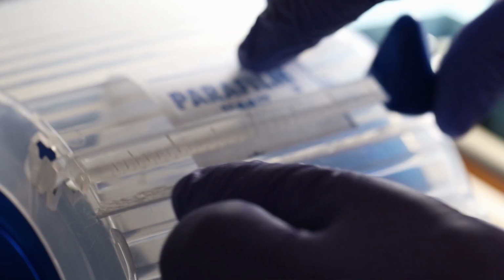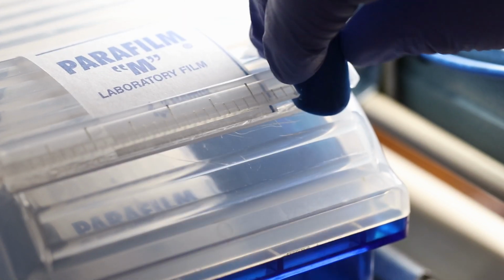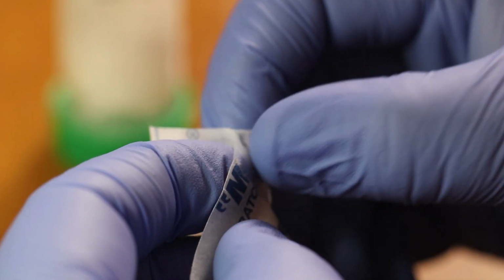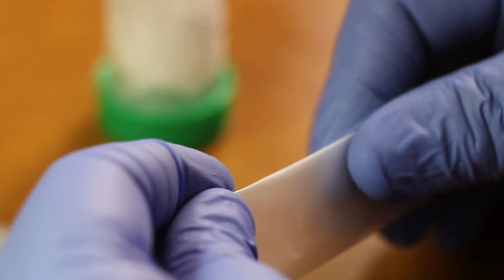Then we just take our parafilm. I love these parafilm dispensers. You just take that, cut your piece. We're then going to tear it and peel and fold our parafilm. I've shown this in the video before, but I really like folding it. Helps it hold up better.